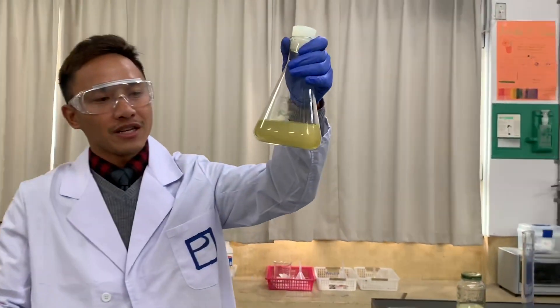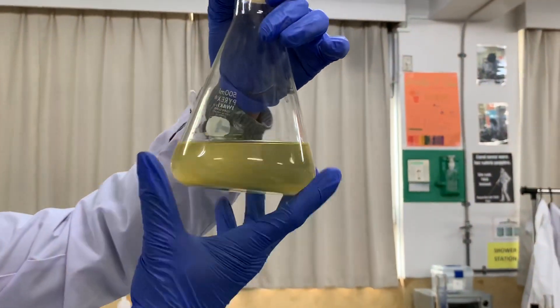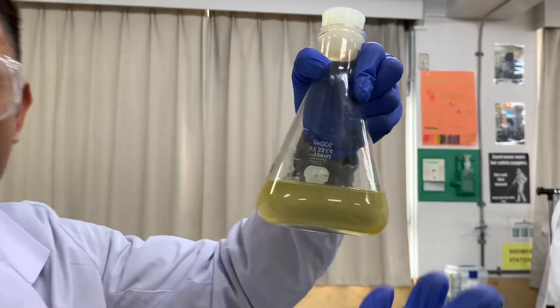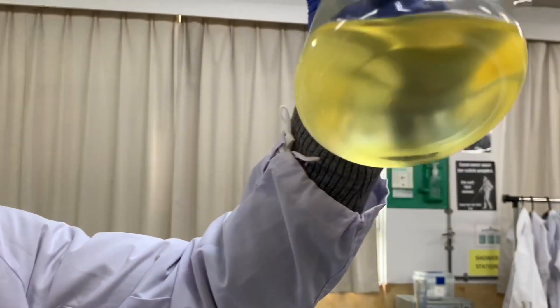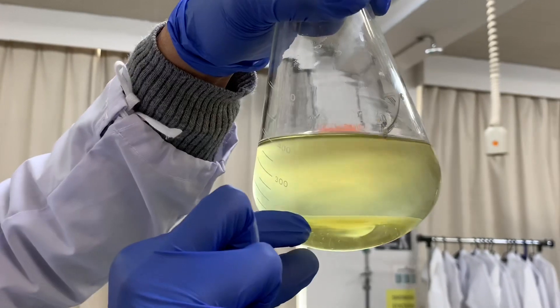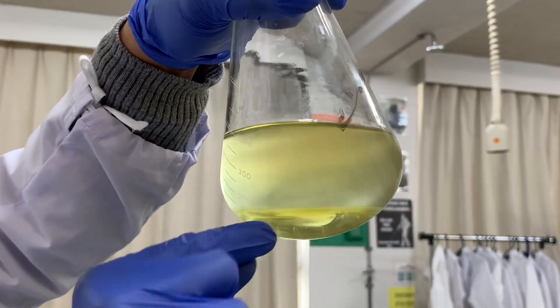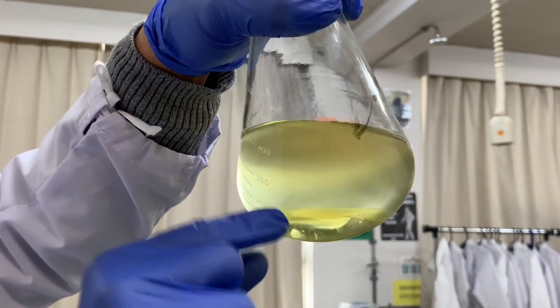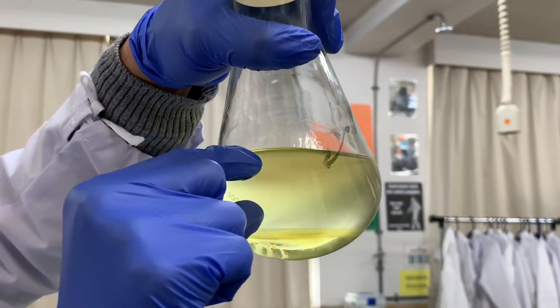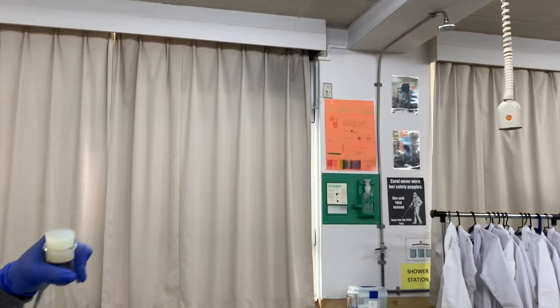This is the final product after 10 minutes. You won't be able to see the separation easily in the conical flask, but if you tilt it you'll see the lower phase — the clear one is glycerin, which we don't want. The cloudy part is the biodiesel. We're going to decant the biodiesel to another flask and start washing it.